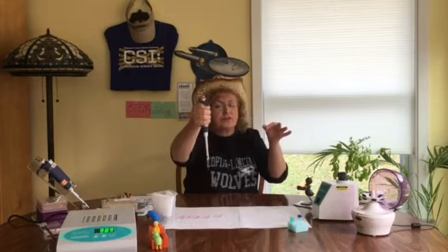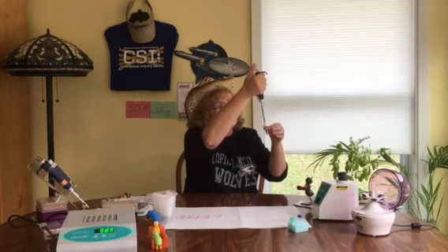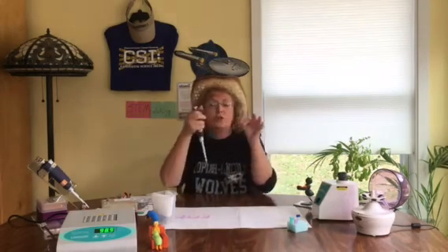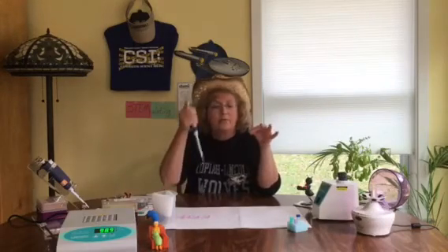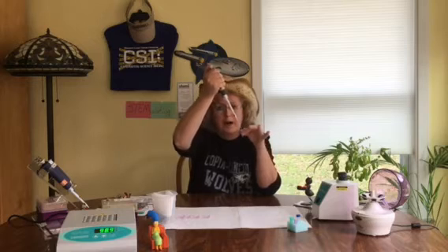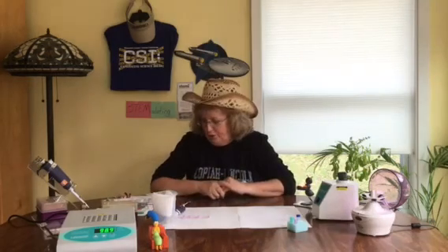I'm going to get just the supernatant, going to the first stop only, just beneath the surface, closing this off. My newly labeled tube, which will store purified DNA, 50 microliters. Pop the tip. You now have your 50 microliters, which will continue on to the next step of PCR. You would do the same thing for the remaining 4 tubes.